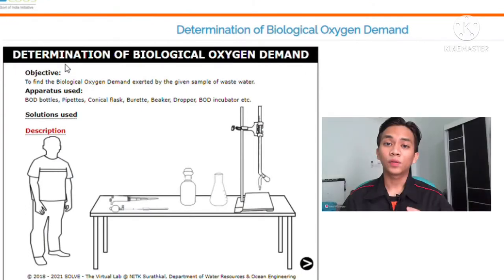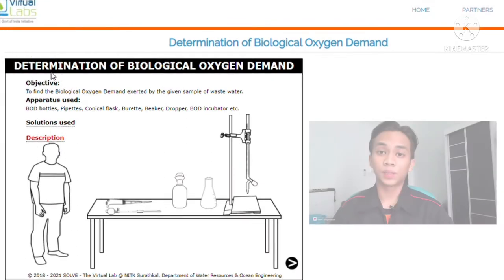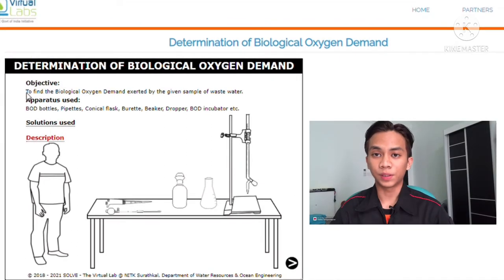Today, I want to present about the simulation of biological oxygen demand, or BOD, experiment. The objective of this experiment is to find the biological oxygen demand exerted by the given sample of wastewater.